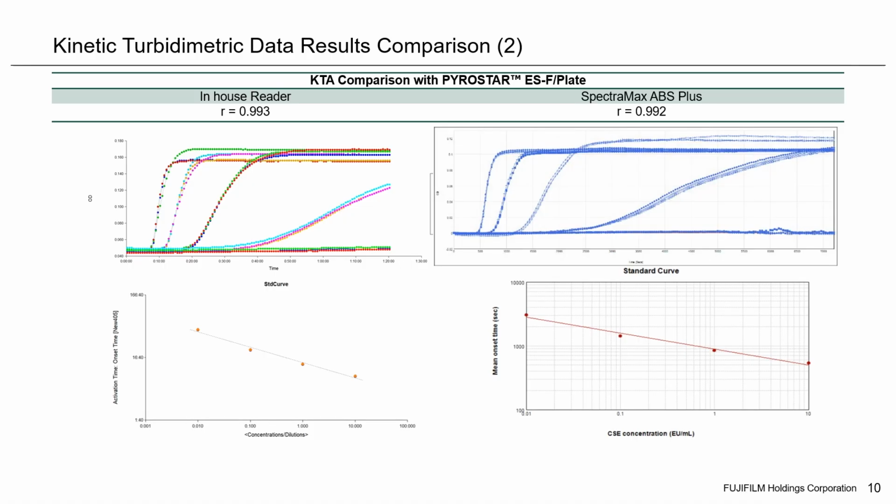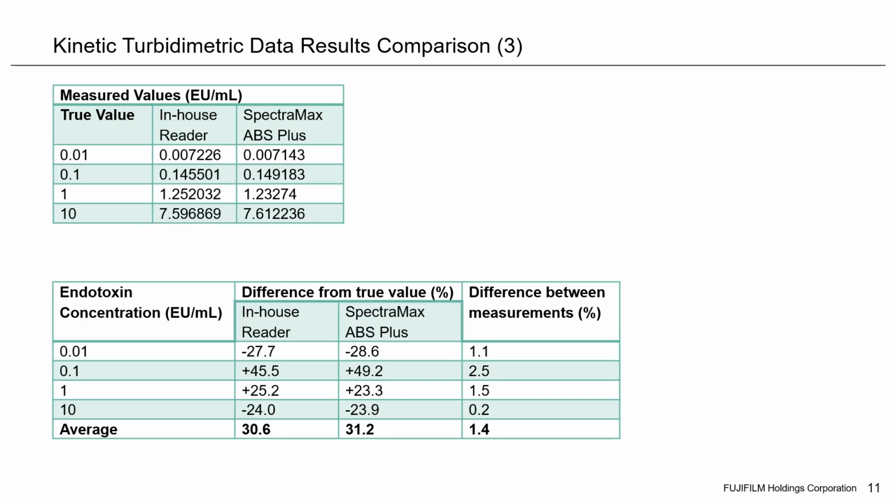And so that reason right there, with that threshold value of 0.015, is the reason we got slightly different activation times. However, we can, in a sense, cross-reference calculated values into the standard curve to eliminate some of these variables that would have come about by the optical density. And I show that right here.